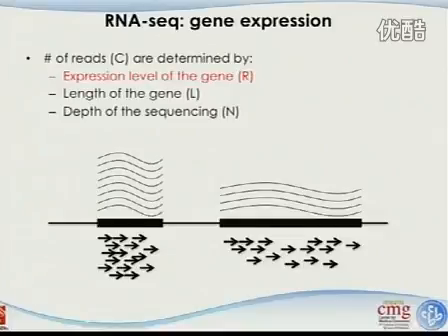Okay? But things become a little bit more complicated with this type of scenario because, as you can see, the longer the gene is, even with much lower expression levels, if you only count the total number of reads, they are the same. So it's not a very reasonable, very accurate measurement. It's only based on the counts, right?